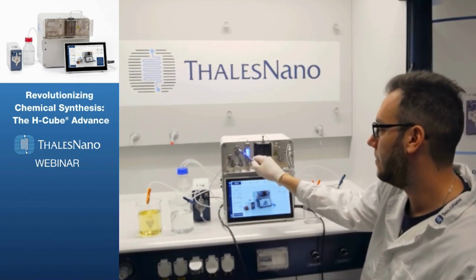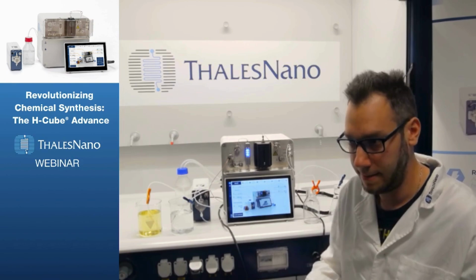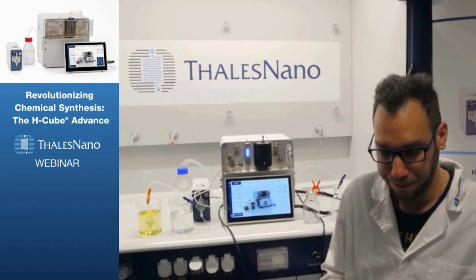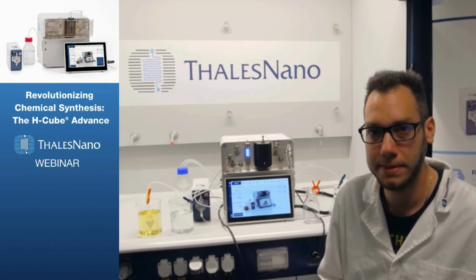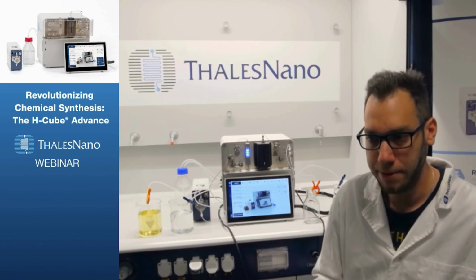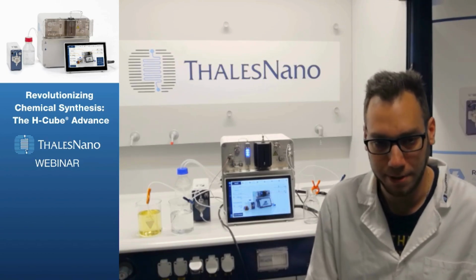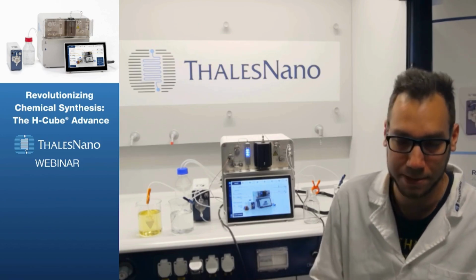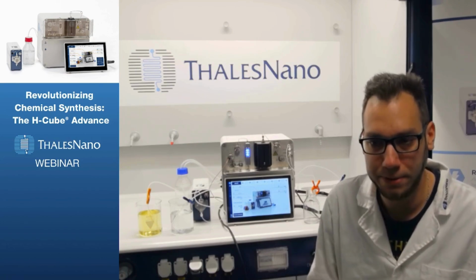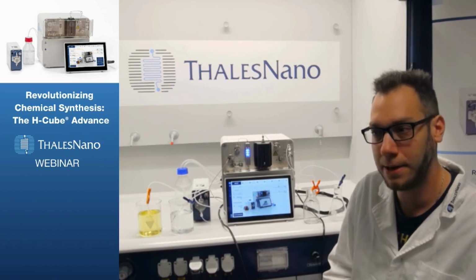And then the next step on the front panel tubing is a pressure sensor. There are two pressure measurement points within the flow path, and this is the inlet side, the inlet pressure, and that's useful because the filled catalyst columns, we like to call them the cat carts, that is short for catalyst cartridge. If you inject a gas liquid mixture through the cat carts, there's a natural phenomenon of a pressure drop, so there will be a pressure difference between the inlet side and the outlet side. And this is a characteristic parameter of flow chemistry, that any filled column will have a pressure difference between its inlet and its outlet.